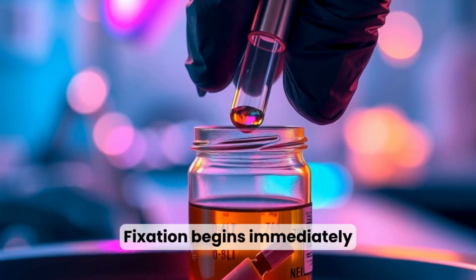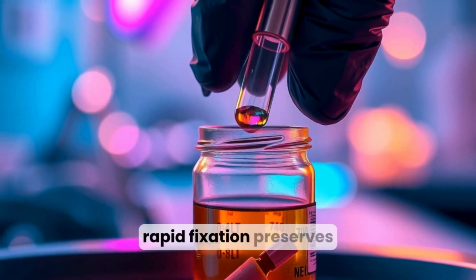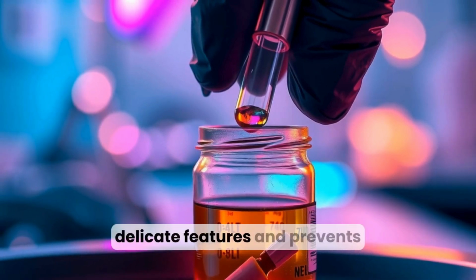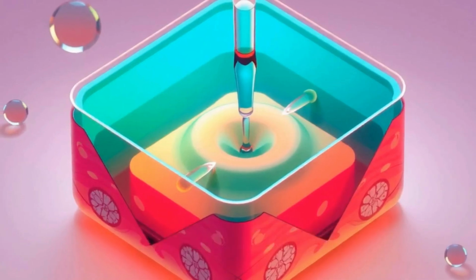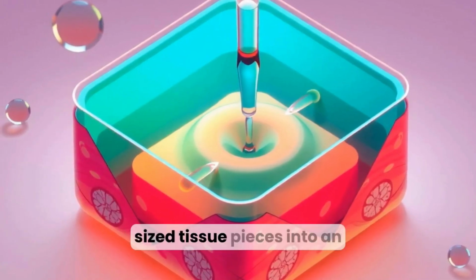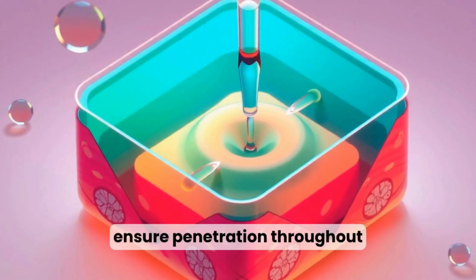Fixation begins immediately after tissue removal to minimize post-mortem changes. Rapid fixation preserves delicate features and prevents autolysis. The primary practical step is immersion of appropriately sized tissue pieces into an adequate volume of fixative to ensure penetration throughout.